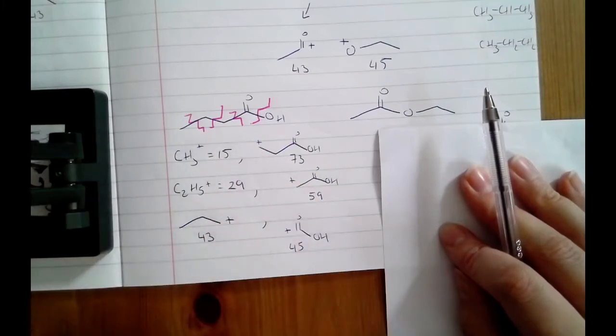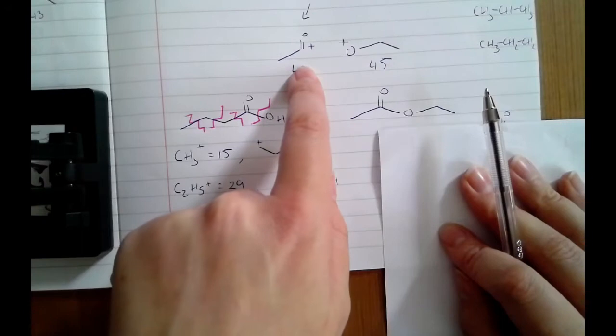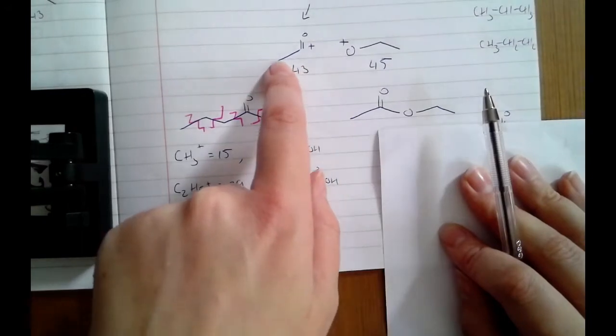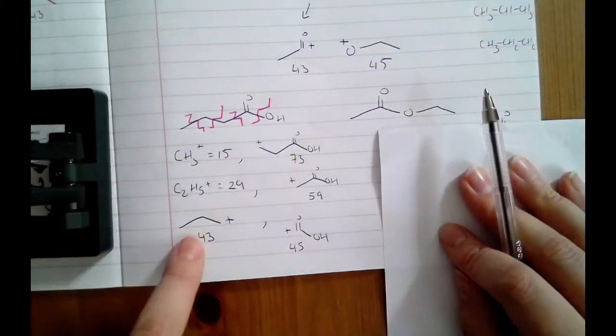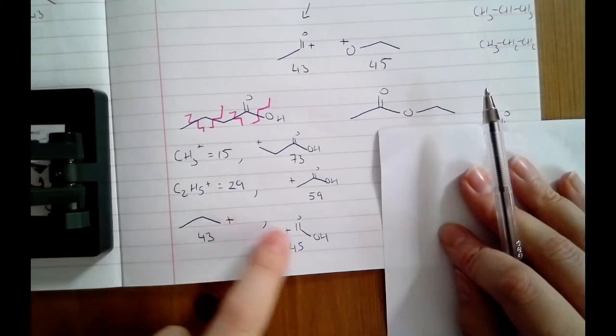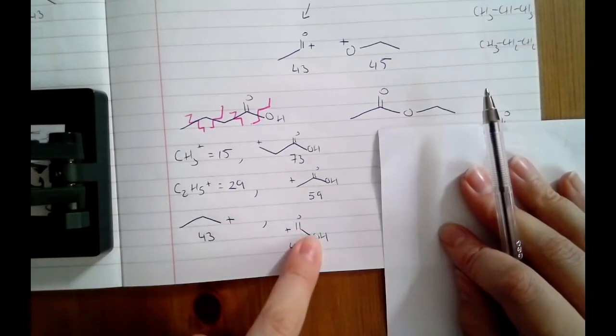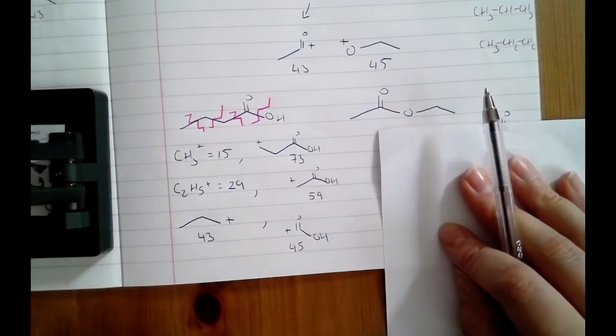Therefore, you'll get a peak in the same place. You can also remove a peak at 43. Again, this is different from the peak that we removed from the ester. Instead of having a CH3CO, I am now removing a propyl group, C3H7. But these peaks will look the same on a mass spec. They've got the same formula mass, so it doesn't matter that they're caused by different atoms. They will appear in the same place. And then I have this COOH group at 45 instead of what I had up here. But again, still 2 peaks in the same place, even though they're caused by different fragments.